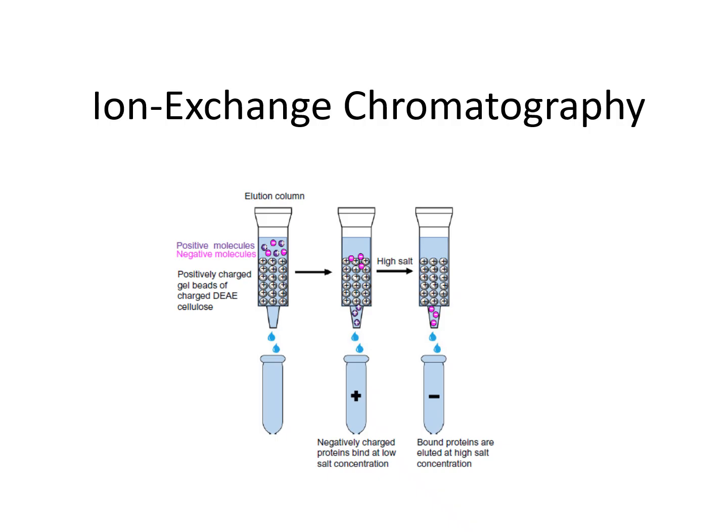And the next one is ion exchange chromatography. Basically, they use a resin to separate proteins according to their surface charge. This type of column contains a resin bearing either positively or negatively charged chemical groups. Resin containing positively charged groups attracts negatively charged solutes and is referred to as anion exchange resin. Resin with negatively charged groups is a cation exchanger. In low-salt solution, protein with a negative surface charge will bind more strongly to a positively charged anion exchange column. Protein with a positive surface charge will bind to a negatively charged cation exchange column.